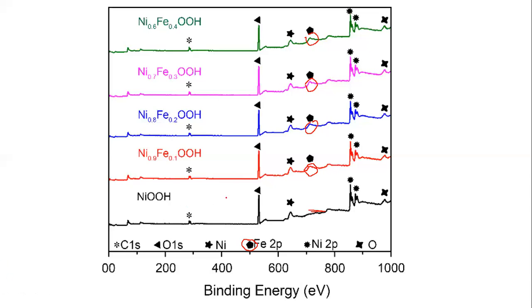Everywhere you see the peaks that I have marked by this triangle and this star, you can easily understand that. And this is a different star, which I expect has almost 12 arms. So these are the same, common in all spectra, but the one which is new comes from here.